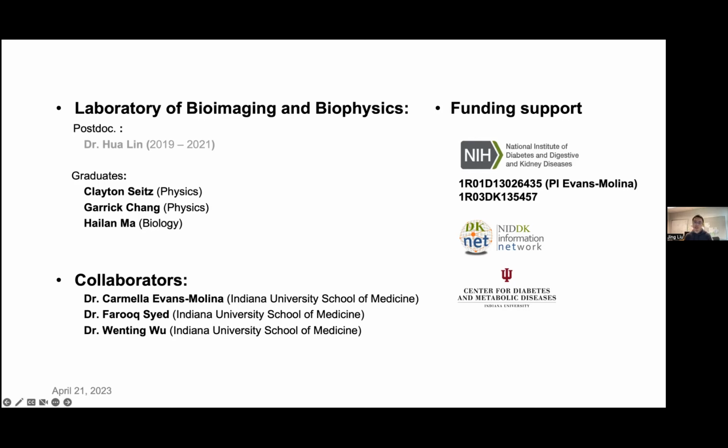So I think our work is a step further into the subcellular location. And I think many people are paying attention to this kind of phenomenon and these data sets, because this is a tremendous data set that can be very useful. There's a very recent paper in Nature Methods, I think last week, talking about the subcellular location of the RNAs and how that is associated with the cellular functions.